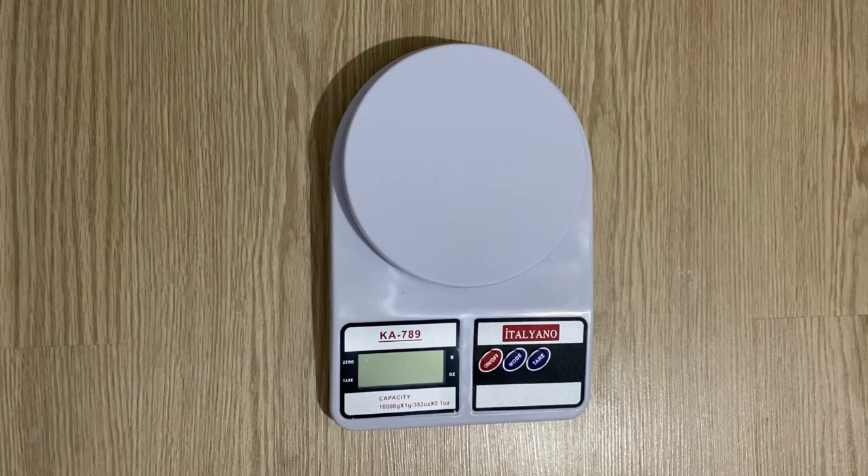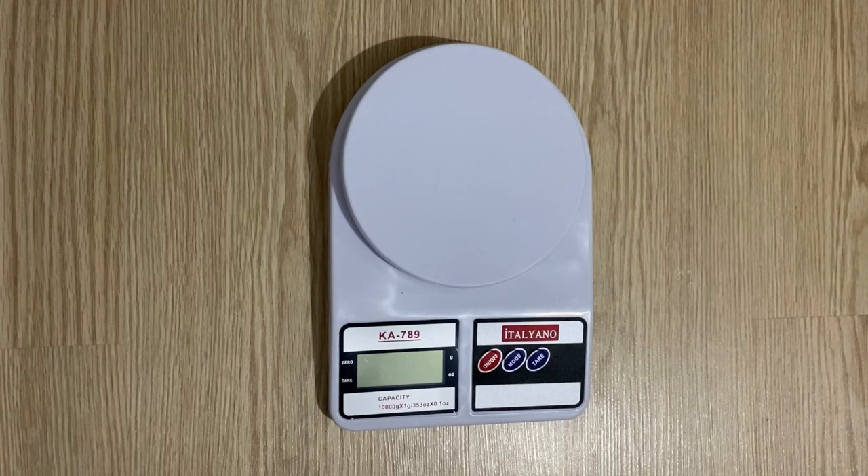Hi my friends, I hope you're all fine. In today's video I'm going to show you how to make polyvinyl alcohol binder. It will be a very short but very useful video, and we are going to use this polyvinyl alcohol binder as a binder for our supercapacitor. Let's start.